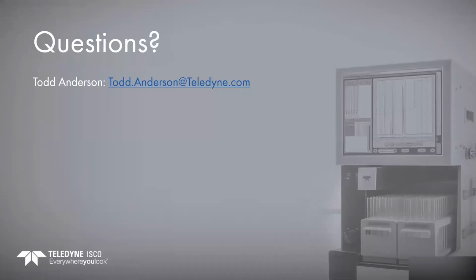One of the better questions actually that I didn't get into is, with the PDA technology that is used in the HP 150, is it enough to consider the purity of the purified samples? And the answer is, I typically do. I would say that if I'm running purity like that, I can get a ballpark of whether or not it's pure or not, just based on seeing the different UV spectrum across the peak.